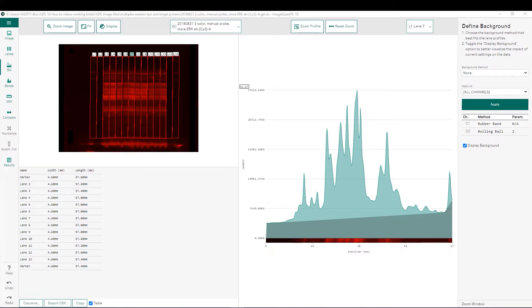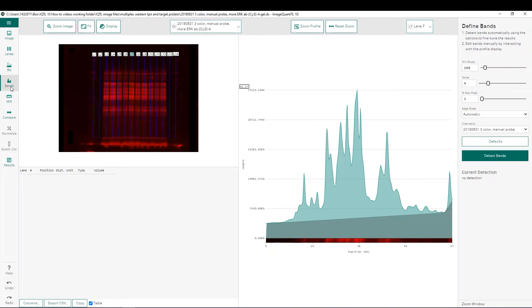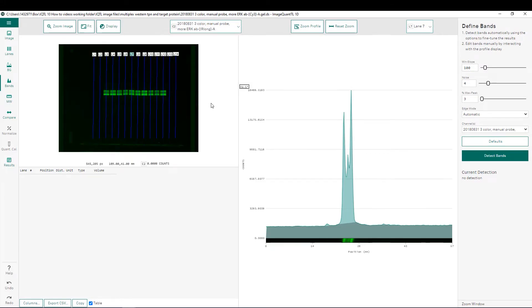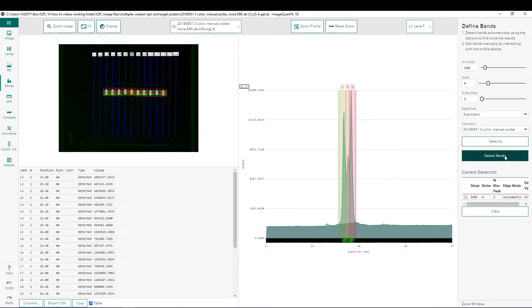The next step is detecting our bands. For a total protein normalization analysis, there is no need to detect bands in the total protein normalization channel, because normalization will be done using the total summed intensities of all pixels within each lane. We can display just our protein of interest channel, then use the default parameters to detect bands. If changes are needed, you can adjust the minimum slope parameter — increase it to decrease sensitivity if too many bands are detected, or decrease it to increase sensitivity.